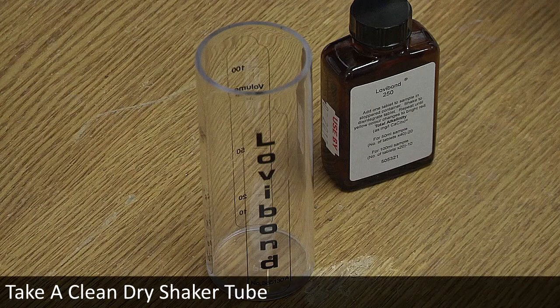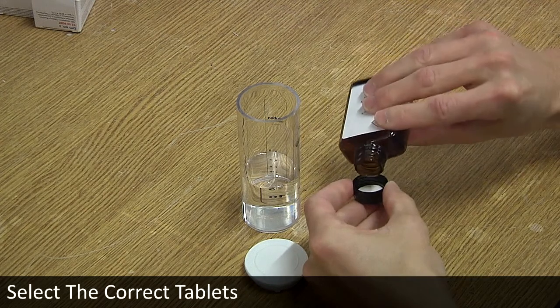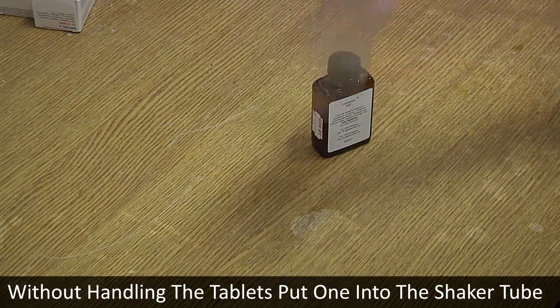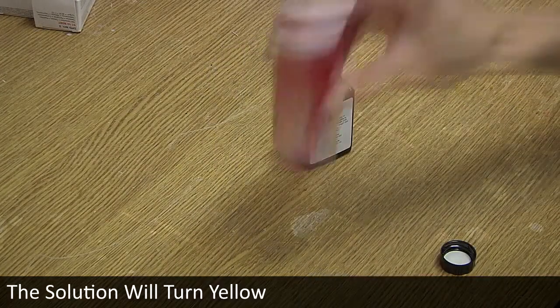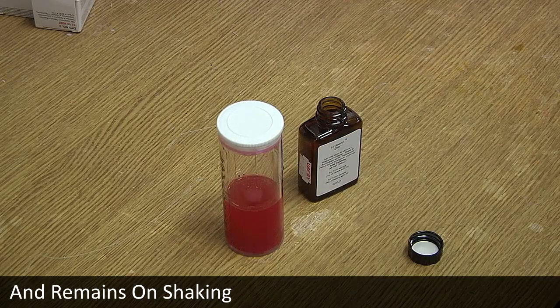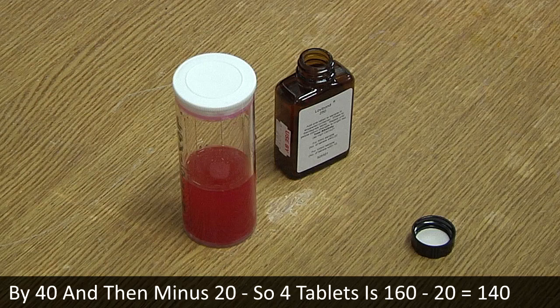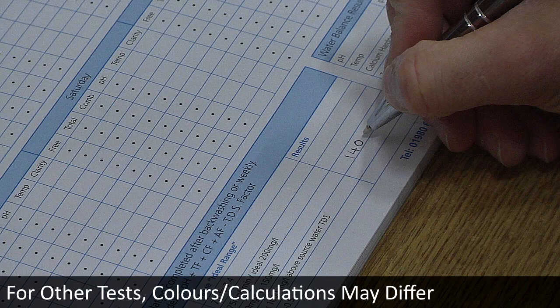Take a clean dry shaker tube, open the lid and fill to the 50 millilitre mark with water sample. Select the correct tablets and, without handling the tablets, put one into the shaker tube. Replace the lid and shake until the tablet dissolves — the solution will turn yellow. Continue to add tablets one at a time without handling until a permanent pink colour is produced and remains on shaking. The result is calculated by multiplying the number of tablets by 40 and then subtracting 20. For example, four tablets gives a result of 140. Record the results on a log sheet. For other parameters, the colour changes and calculations may differ.